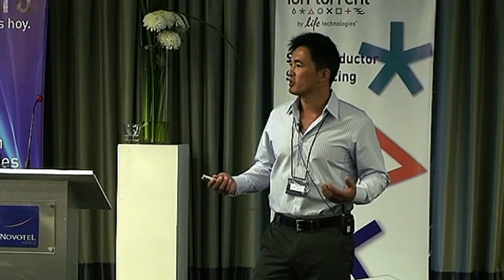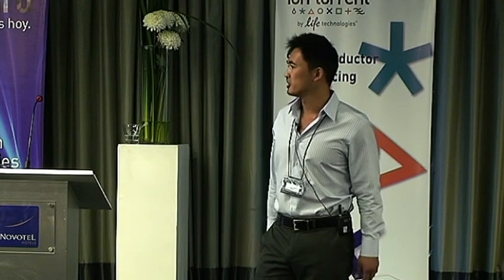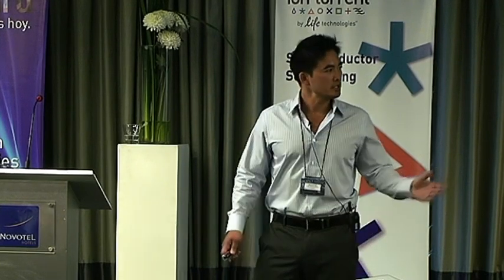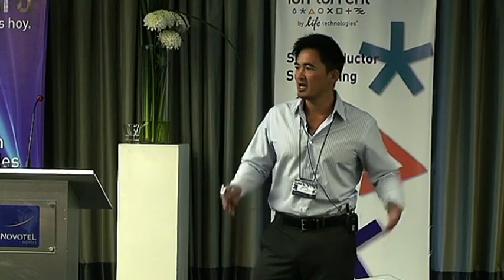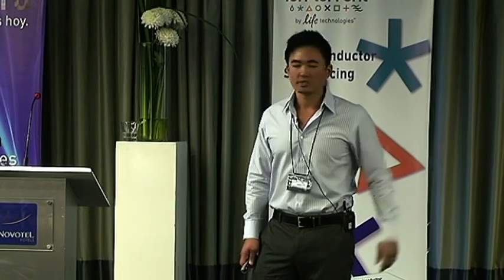the discussion of QuantStudio and how it actually ties into genetic analysis, how it relates to Ion Torrent PGM, next generation sequencing. So typically when we do these talks, I actually come after the next generation sequencing part. And the reason why, obviously, is because this is a qPCR technology, which is a validation platform. So in the workflow, in the paradigm of genetic analysis, of course we're always starting with hypothesis-free discovery on an Ion Torrent platform or a next gen sequencing platform. And then you come back afterwards and do a more refined pinpoint validation using qPCR technology.